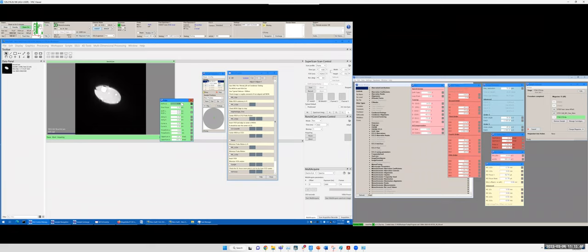And then actually you can evaluate things. Oh, okay. So you can use the keyboard on the microscope, the up and down arrow. If I click up, you can see the strength is 10 micrometer. If I click down, it's 1 micron.